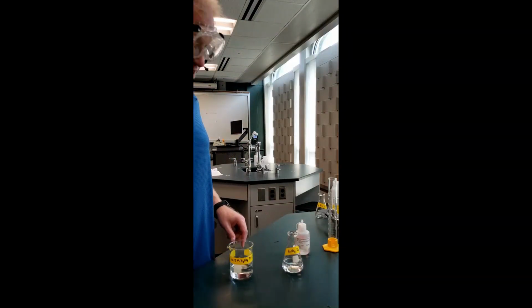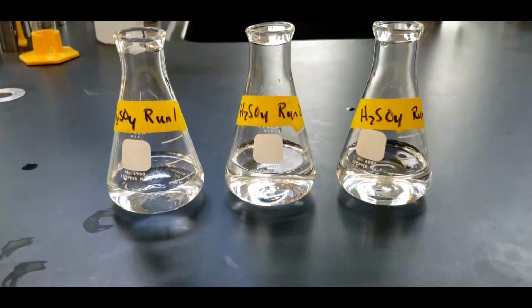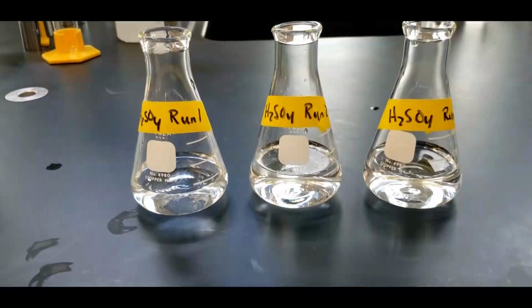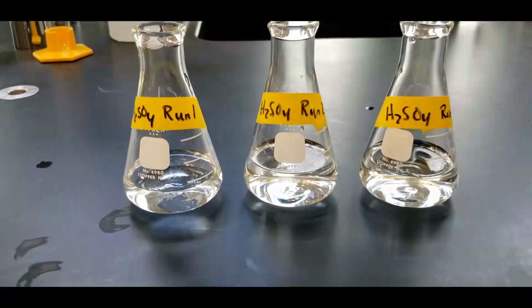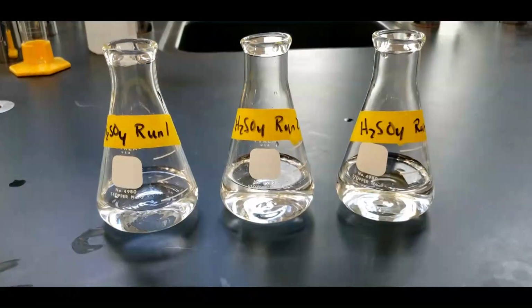I'm going to do this 2 more times. Here are the 3 samples for the sulfuric acid. Each one contains 10 mils of the 0.15 molar sulfuric acid, 50 mils of water, and then 5 drops of the indicator. So these are ready for titration.